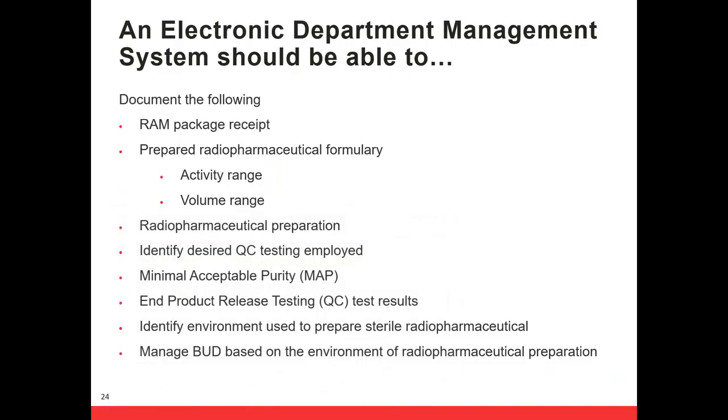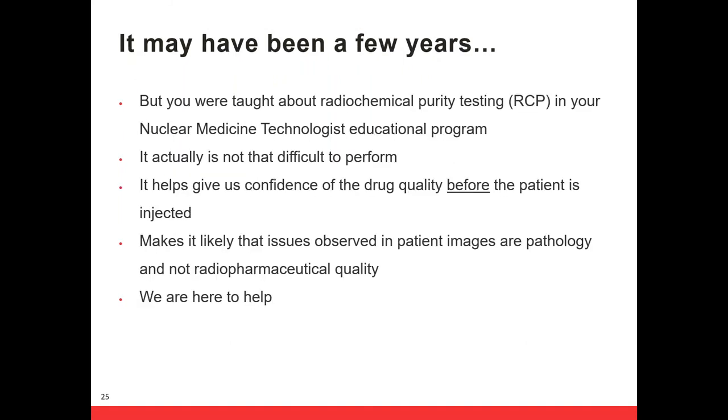So Rich made it really simple to go through, and I appreciated it. Brought back a lot of the information that, quite honestly, I haven't done in years. And I think it's important to review that kind of information. But also, that being said, you know what? We all did this at some point in time, right? We were taught radiochemical purity testing and quality control back during our education programs. I know I was. I won't tell you how long ago it was. But it's been a long time since I've done QC since then.